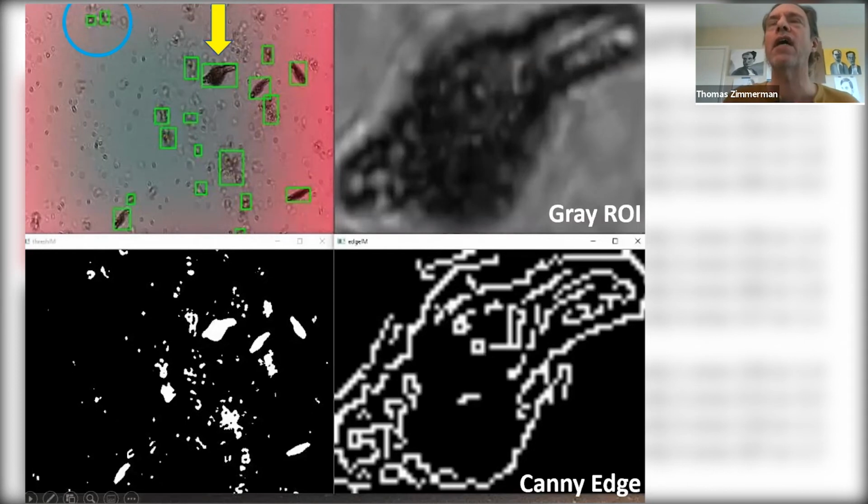Okay, so now remember, this is a frame, one image of video, and there's 30 frames a second. In the next frame, your detector is starting from scratch. It'll detect all the objects in the frame. Usually they're the same number of objects, but some objects can leave the frame, some can enter. Because this microscope is just looking at a tiny area. There are creatures all around this that you can't see. And actually the order is, it basically scans from the bottom right and scans up.